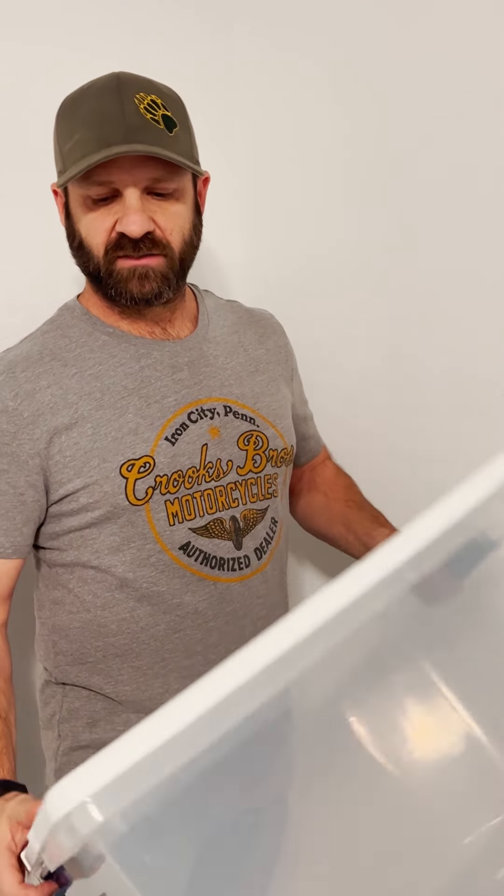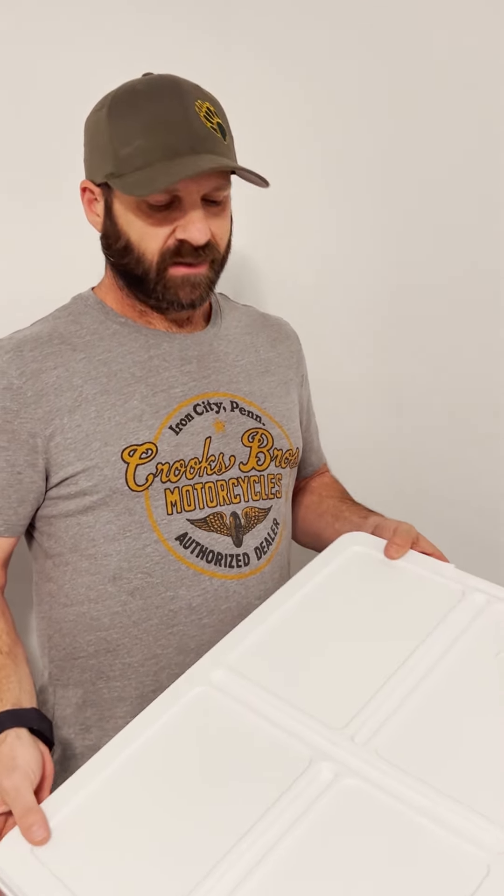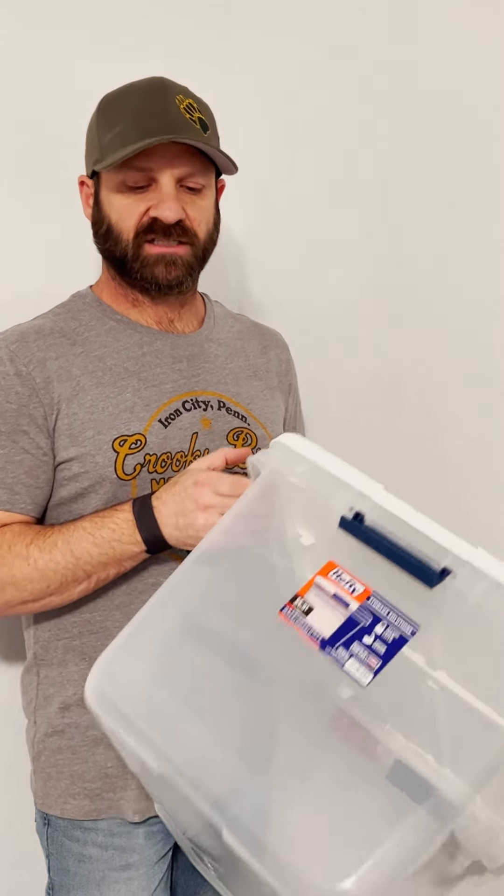When you're just starting out, spending $200 to $600 or even a thousand bucks on a flow hood — that's not really in the cards. But a still air box for $15 or $20 is a pretty simple project to make.